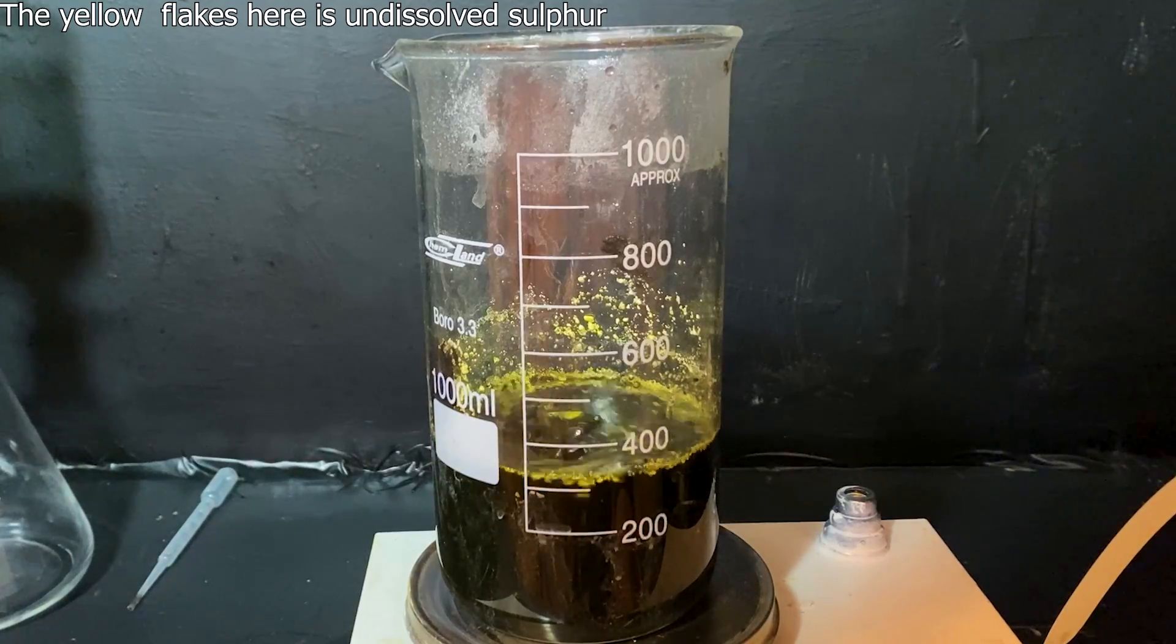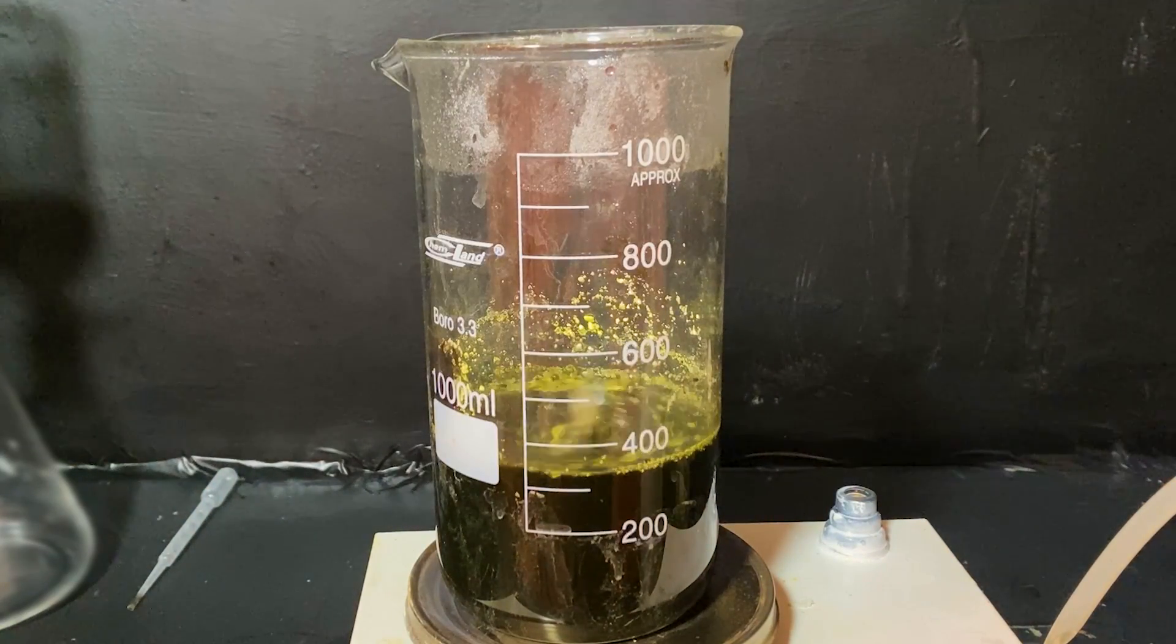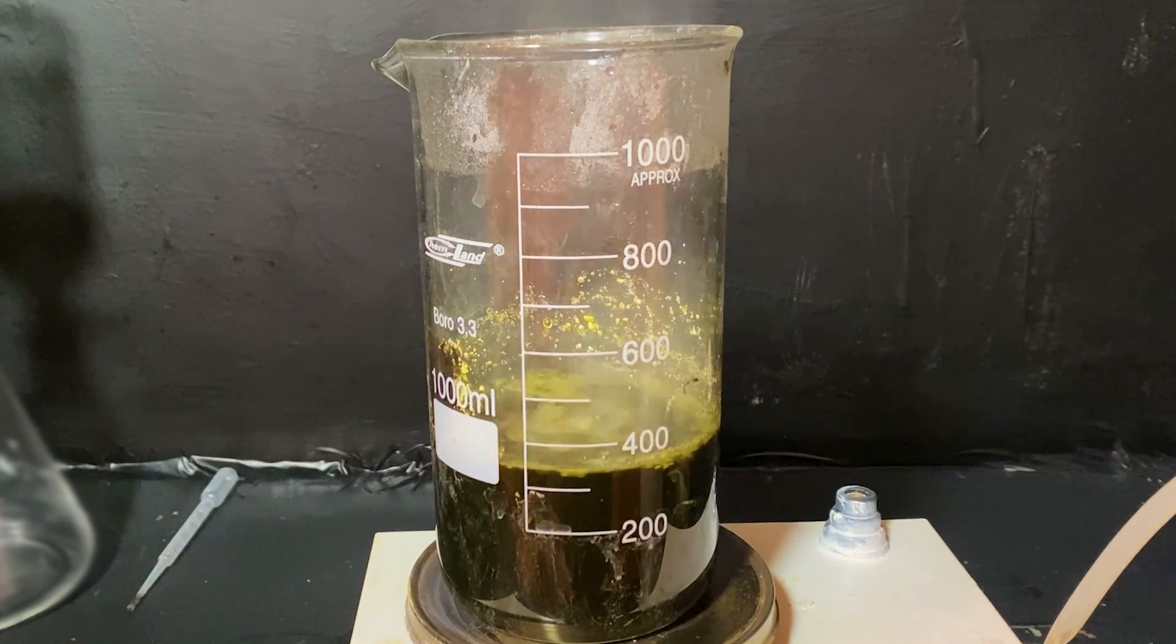Now, to crash out the mercury, I just have to add some aluminum foil, and I've begun by adding just a sliver of it. Immediately, an intense reaction happens where the aluminum is ripped to shreds by the sodium hydroxide and the sulfide complex.